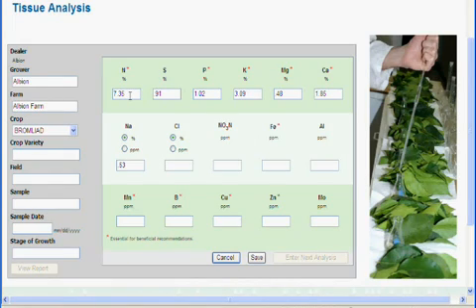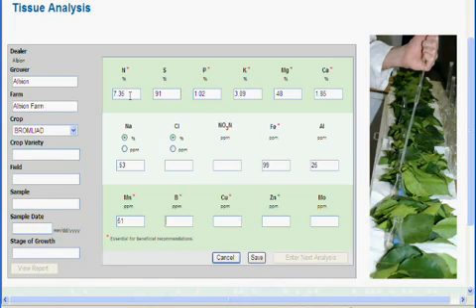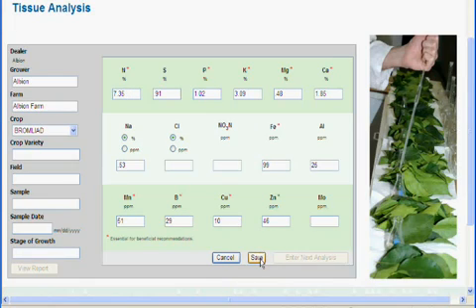These two fields are not required. Continue with iron, aluminum, manganese, boron, copper, and zinc. This one is also not required. After all data has been entered, click Save. This will archive your report and generate your recommendation.